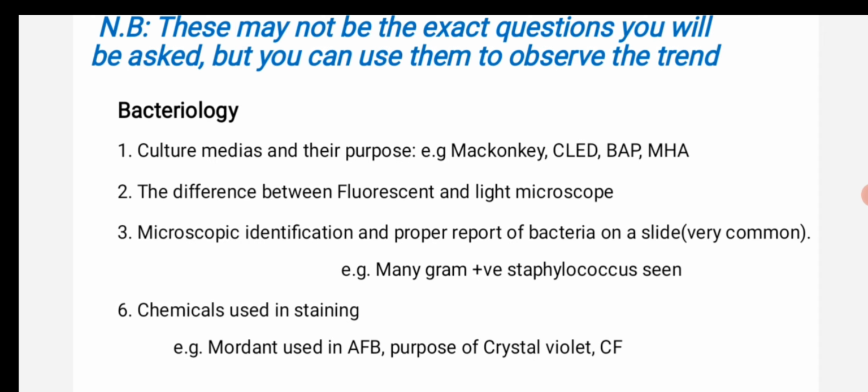This is also very common. We may be given some slides and asked to report what kind of bacteria we see. So we have to follow the correct reporting format for every microbiological identification.